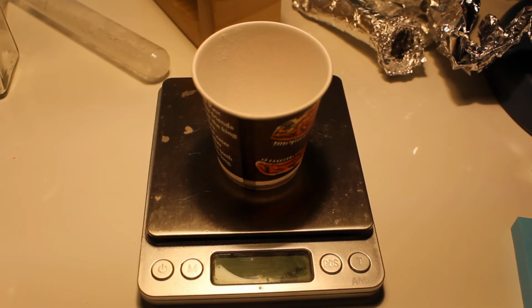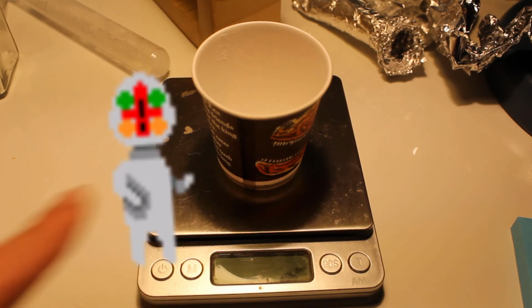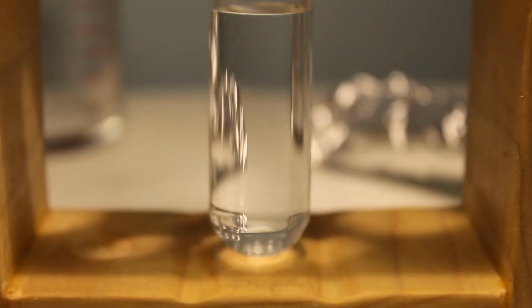Okay, now I'm going to need 1.73 grams of both sodium carbonate and sodium citrate. Now, 173. I'll just put something up on the screen so you get the joke. But let's begin. Let's start mixing this. No more commentary from now on, just doing stuff.